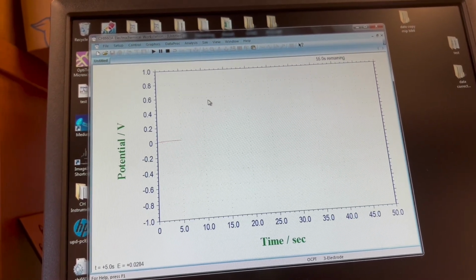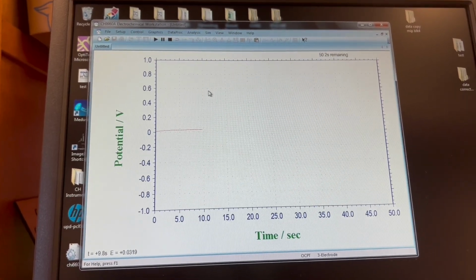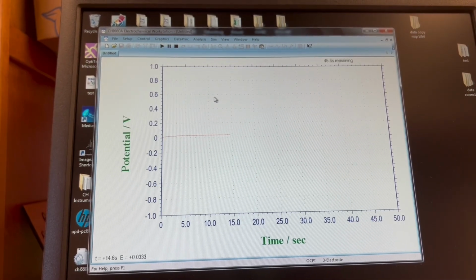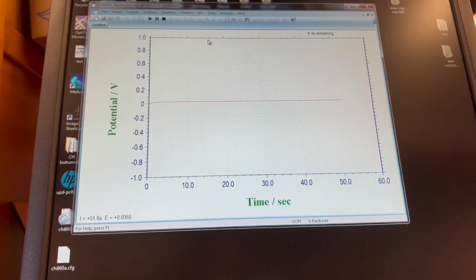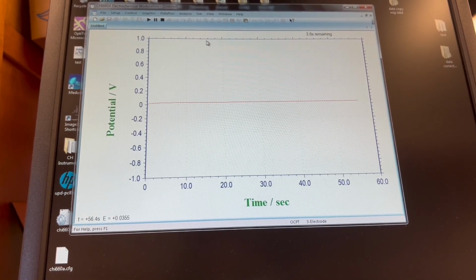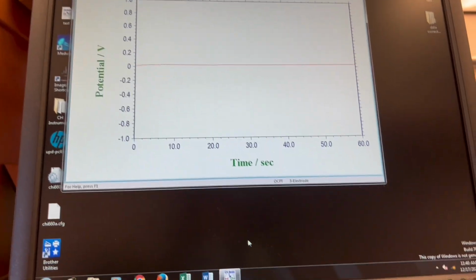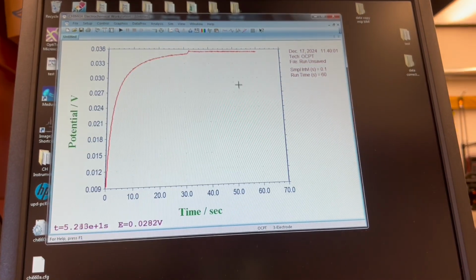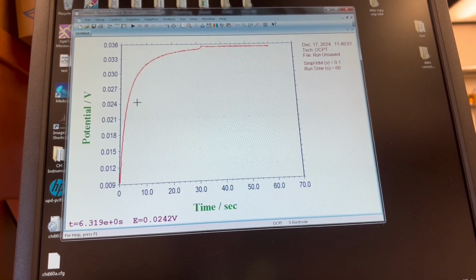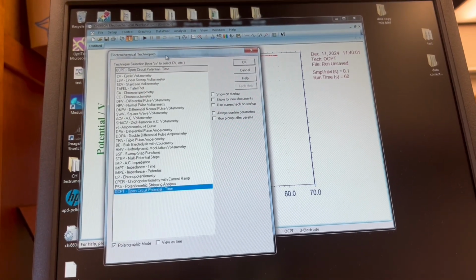And now we could observe a straight line. It is usually around 0. Maybe sometimes it will be higher, sometimes it will be lower. Then we let it finish. And then we click the button to see how it looks, and find the potential that the center of the graph corresponds to.